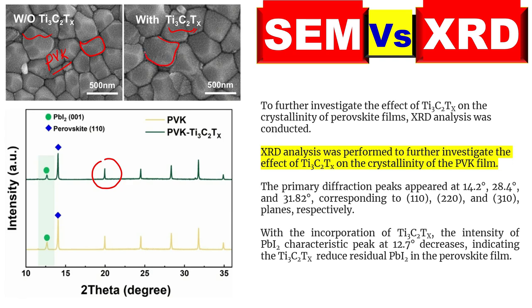Overall, both surfaces look great. We can see that both materials give the same XRD pattern. Very interestingly, the incorporation of this material into the perovskite does not change the perovskite crystal structure.